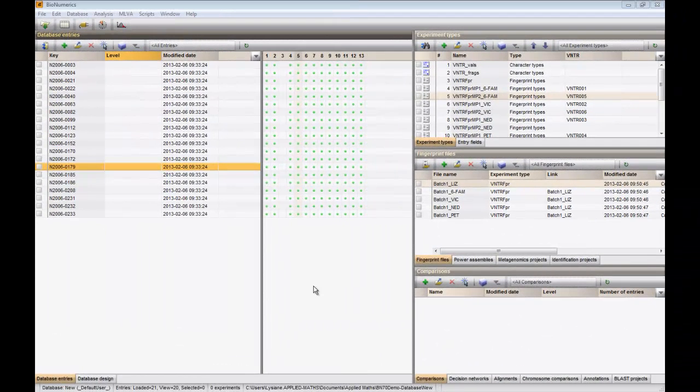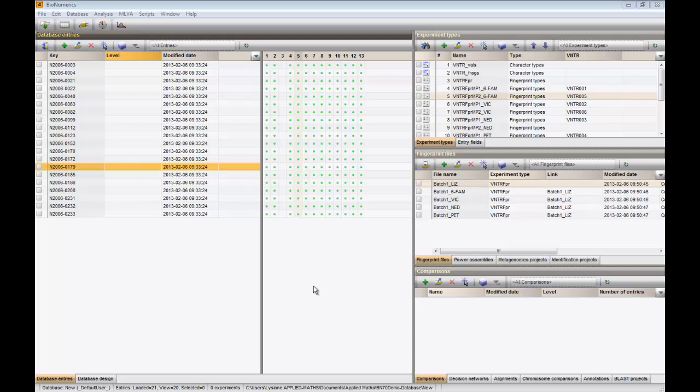In this video, we will analyze the VNTR data previously imported. First I will show you how you can calculate Simpson's index of diversity of the different VNTRs.